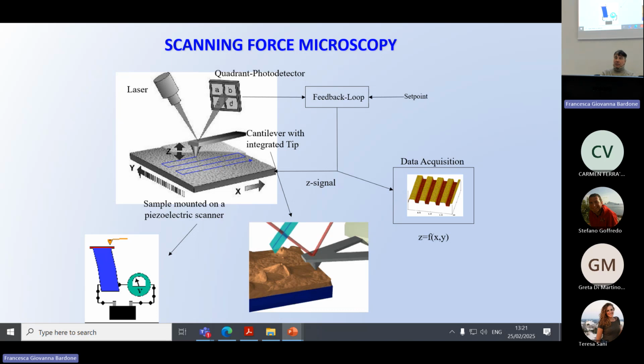If the membrane becomes harder, you can feel that the membrane becomes harder. If the membrane becomes softer, you can feel the membrane becomes soft. You can measure topographical and mechanical properties of your biological material in truly living conditions.